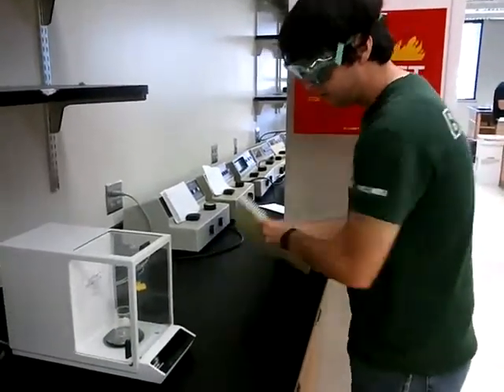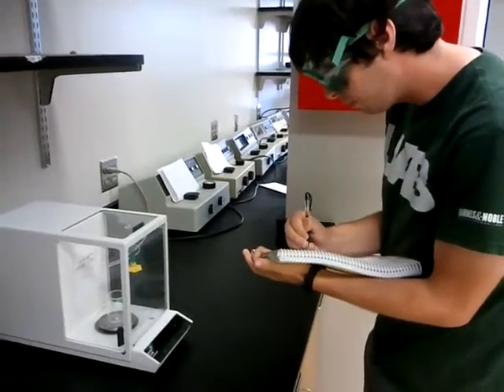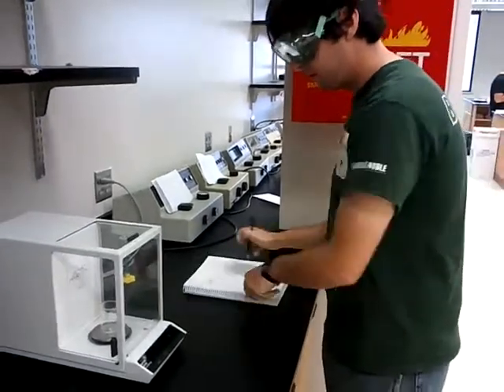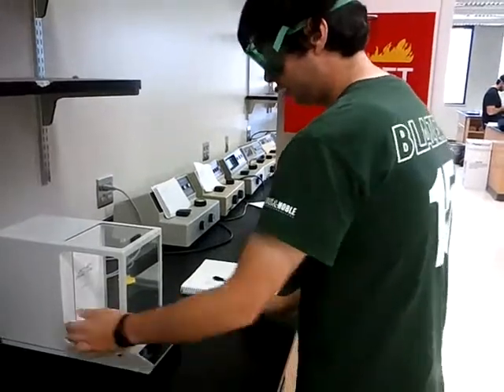And you'll close the door. So, 39.7089. Okay. Now close it.